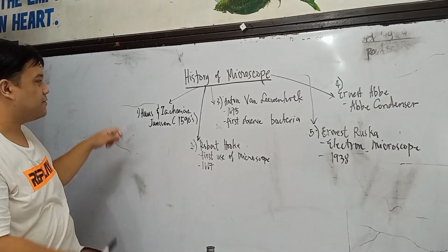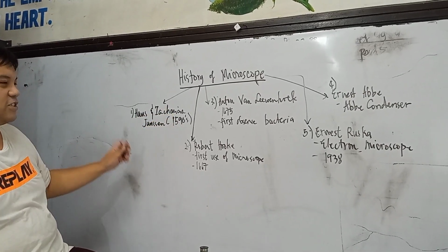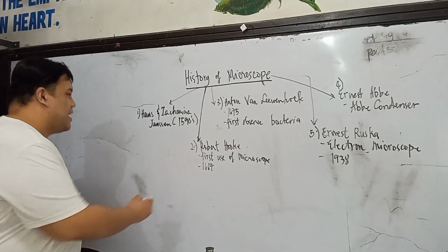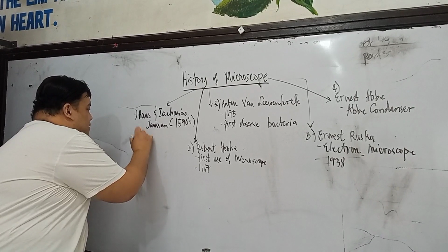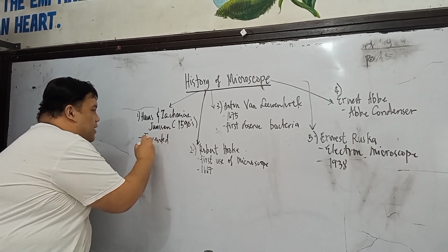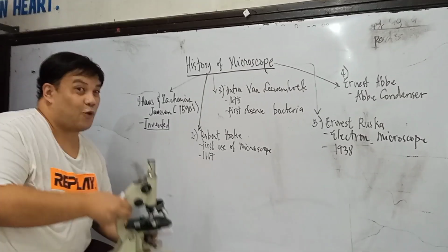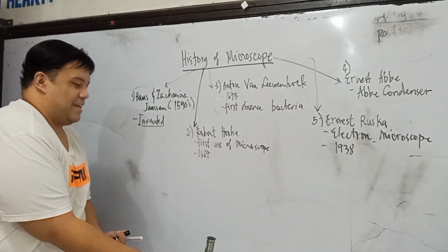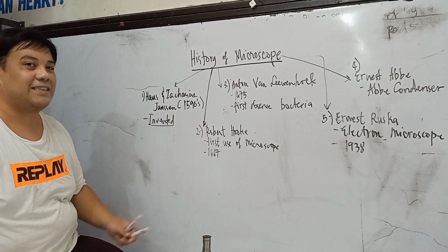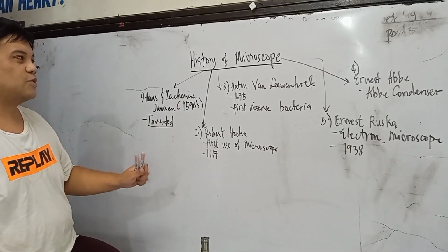First, we have Hans and Zacharias Janssen who first invented the microscope. Hindi pa yan microscope na ganito, ha? Kailan yan? 1590s. Mag-ama sila nag-invent ng microscope.